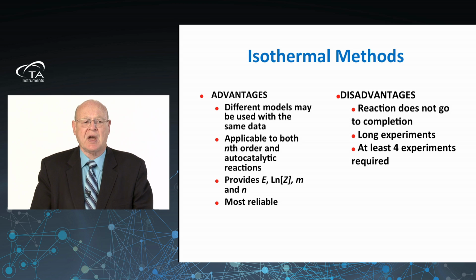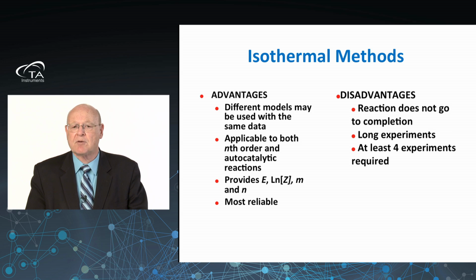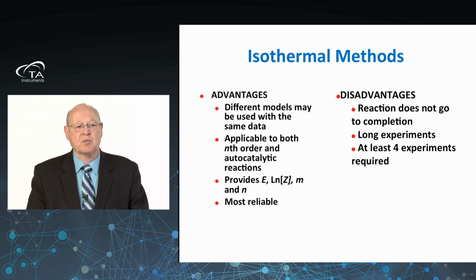There are some disadvantages here. First of these is that the reactions never go to completion. So there is some imprecision in the total amount of the reaction time. Since they're performed isothermally, the reaction approaches completion asymptotically. The experiments are very long.